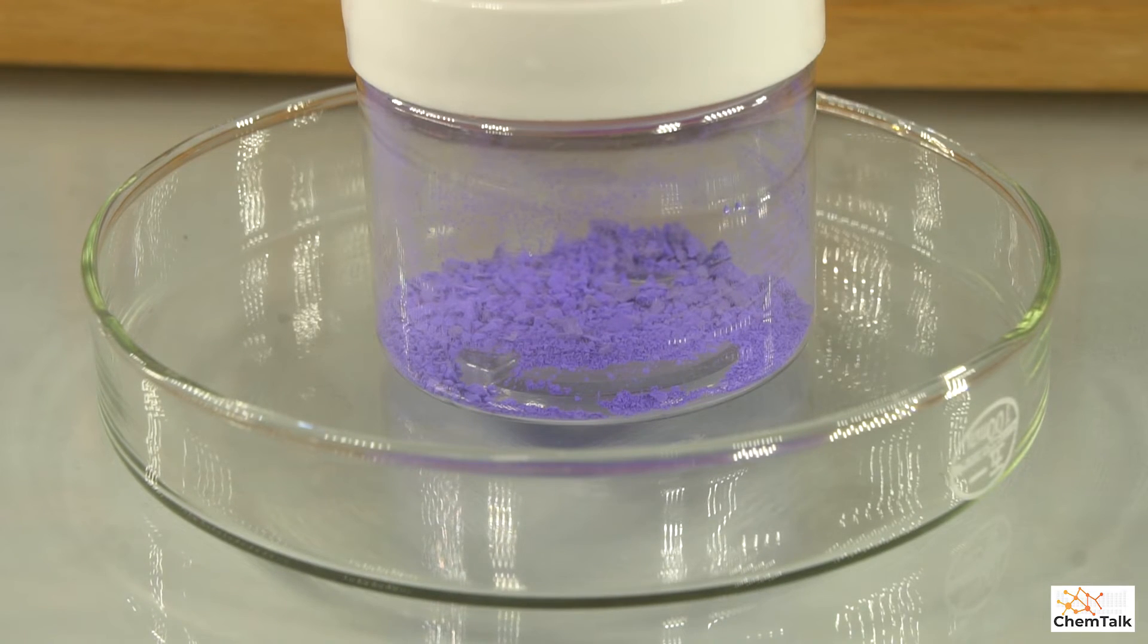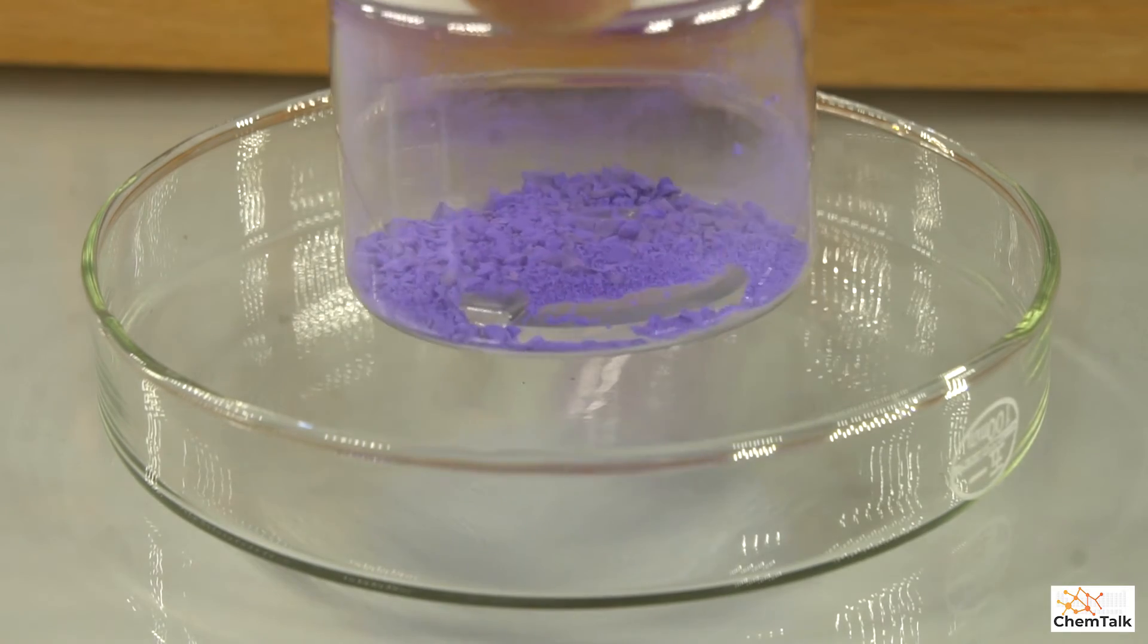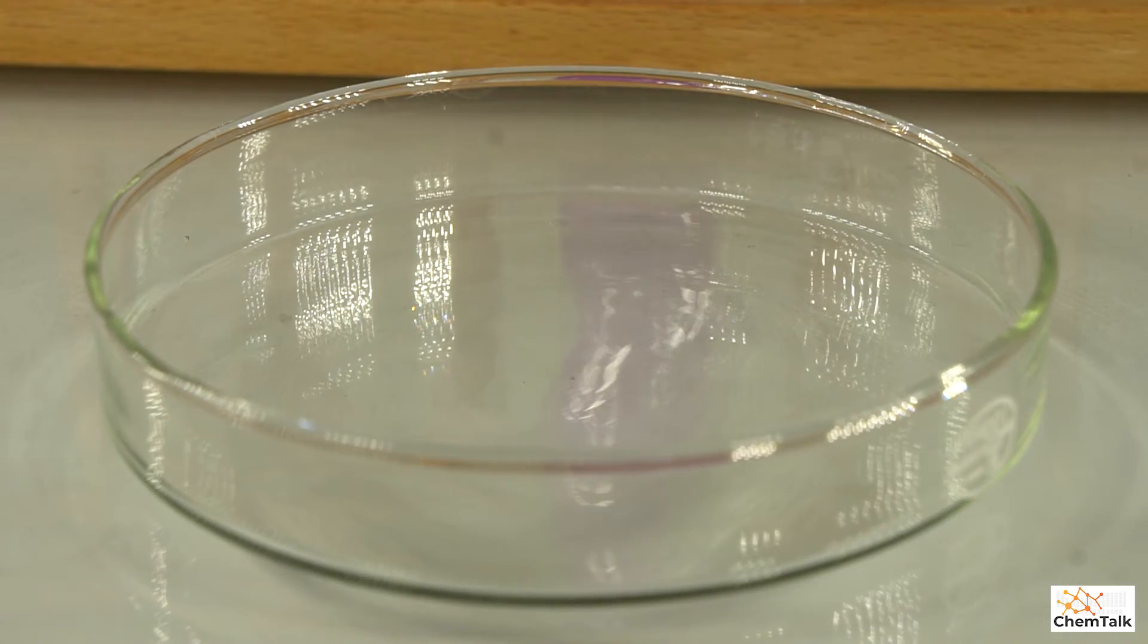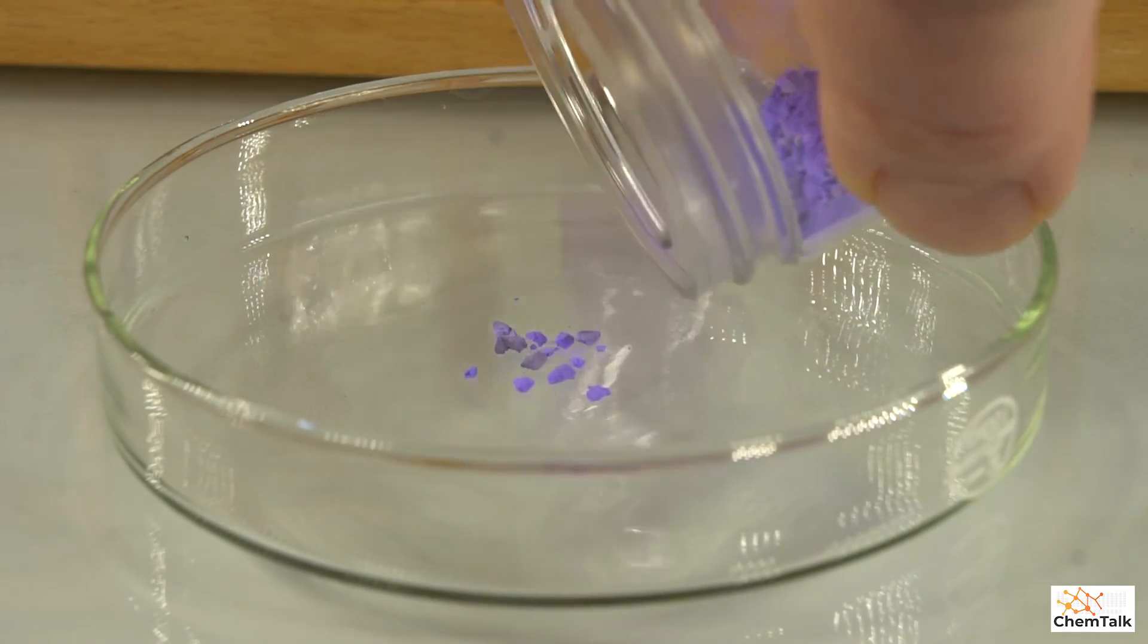So while we're waiting for the precipitate to settle, I'm just going to show you some of the dried out cobalt molybdate that I had made before. And you can see it's a beautiful purple solid.